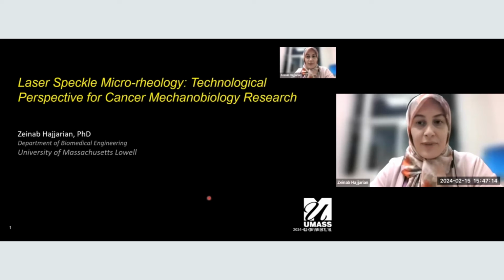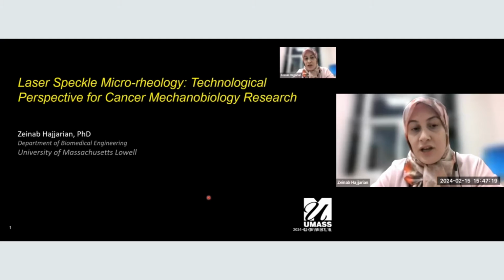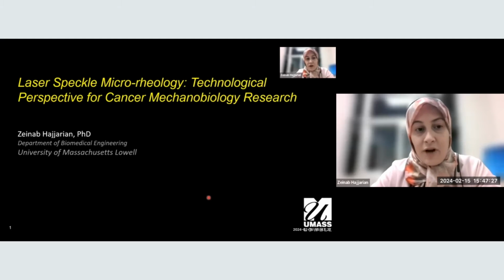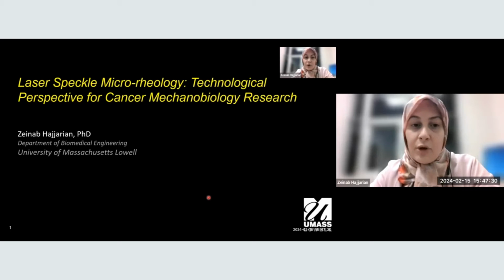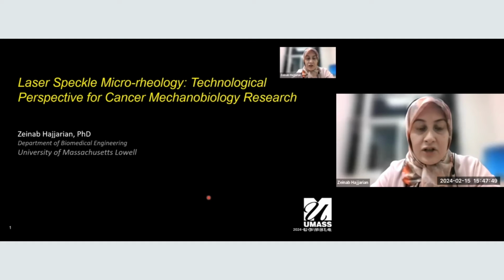So with that, I just want to give you an outline of my talk. Today I will be talking about laser speckle micro-rheology, and I'm going to start with the application side. I'm hoping that I don't bore you too much with the biology of things, but I just want to put things in perspective: why we care about measuring mechanical properties and why we choose optics to do so. And just put this technology in the context of existing optical elastography modalities, and then go forward with how we manage to measure mechanical properties in this way, and what factors we corrected for and considered in these calculations.